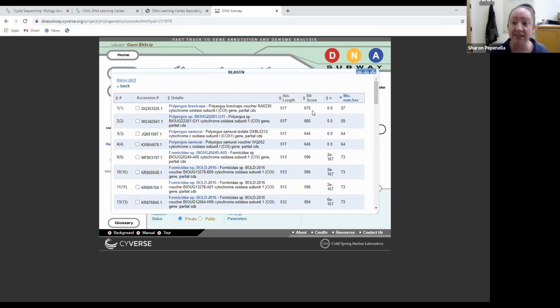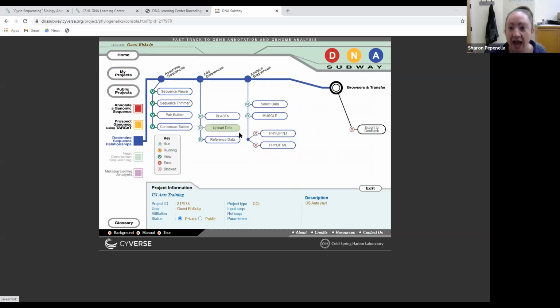So for many of you, remember, we had these targeted hit lists where your sequence for your ant might be available in GenBank, but you may have collected it in a region where the distribution of that ant is not common. So providing that GPS location information to GenBank is also important. In fact, we've had people contact us before who have seen our sequences available on DNA Subway and have said to us, that's really interesting, we've never seen that particular species in the Long Island Sound. Can you provide us with more information about your sample so that it does not go unnoticed? So all of this will get published, but this here is an example of a novel sequence and in fact a novel GenBank record. Okay, any questions about that so far?